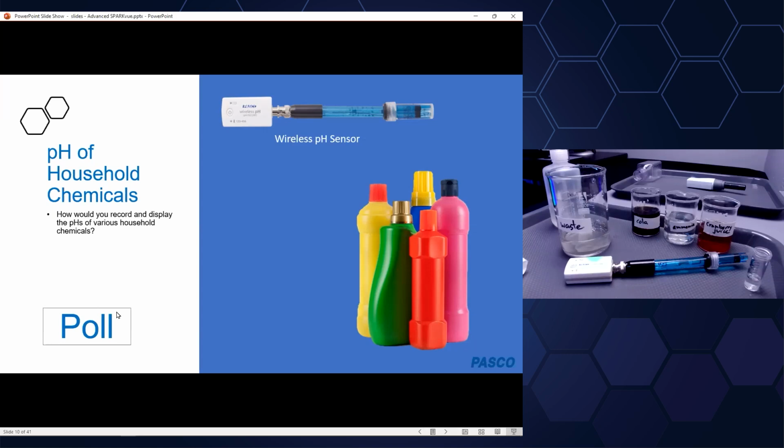So let me pop up a poll here of some answers I've gotten in the past, and whatever your plan is, see if it correlates with one of these three or is completely different from it. So in a moment, a poll will come up for those of you who are live. And the question is, how would you measure the pHs of various household chemicals with the pH sensor and SPARKvue?